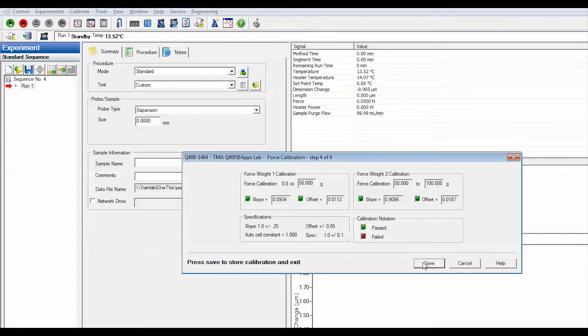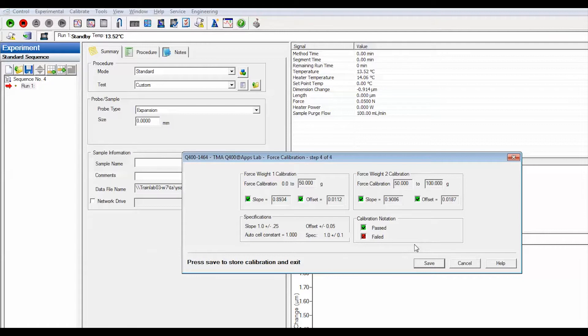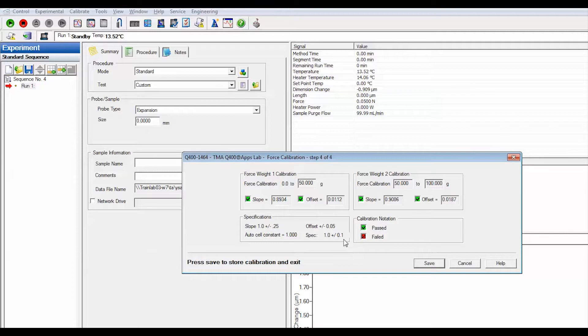Evaluate results. The force calibration slope and offset for weights 1 and 2 are calculated and displayed. The values should fall within the specifications displayed at the bottom of the window.